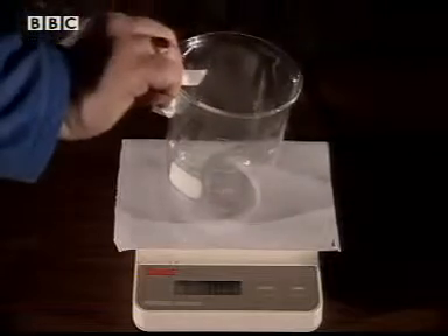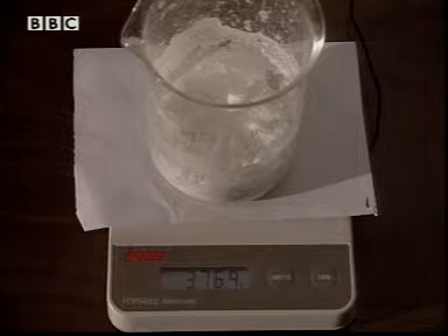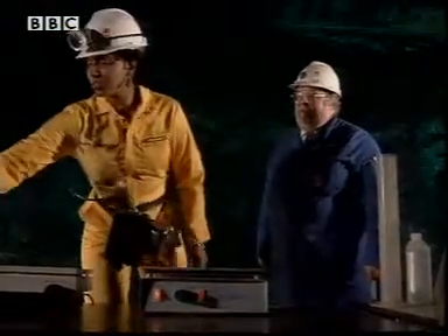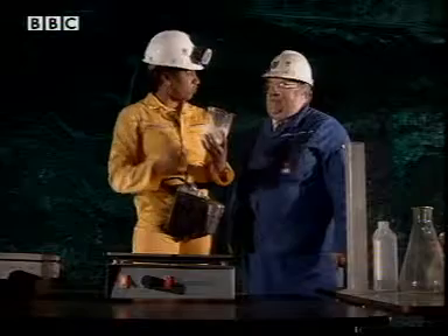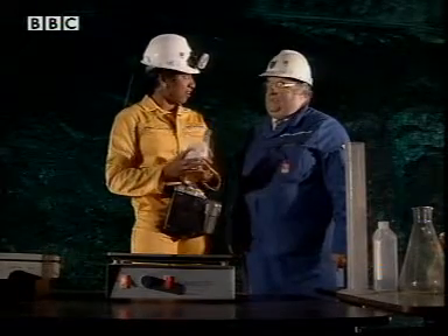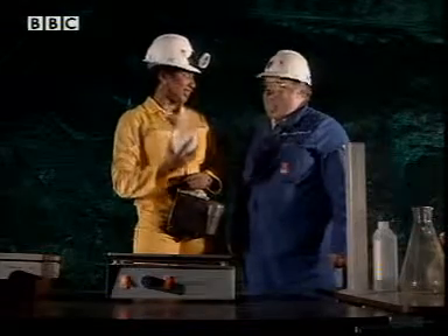By subtracting the weight of an identical empty beaker from the weight of my salty one, I can calculate I have 94.8 grams of salt. So George, 94.8 grams of the original 100 grams mixture is pure salt. That's right Trish, so what we have here is nearly 95% salt.